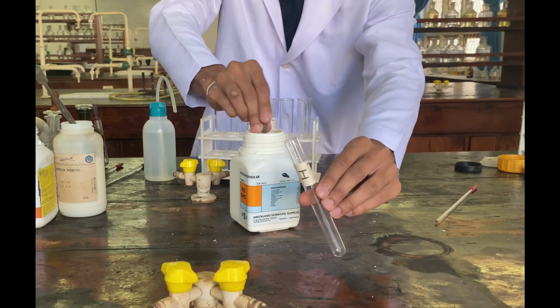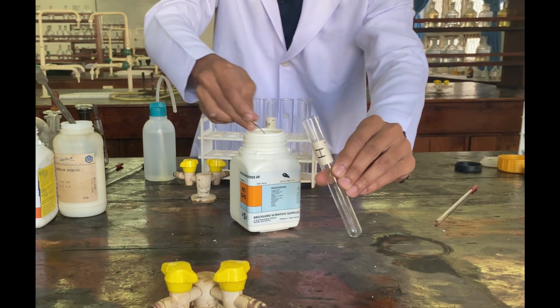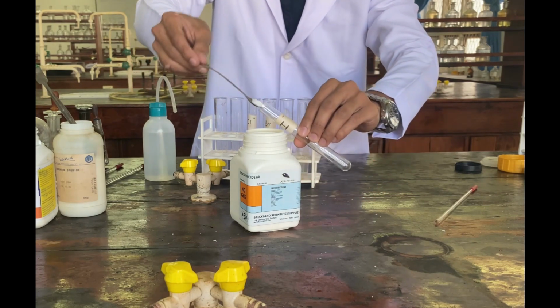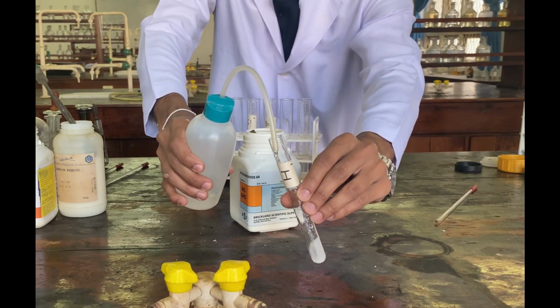Then take a small amount of potassium iodide into a test tube and add a little bit of distilled water. Then make aqueous solution of iodide ions.